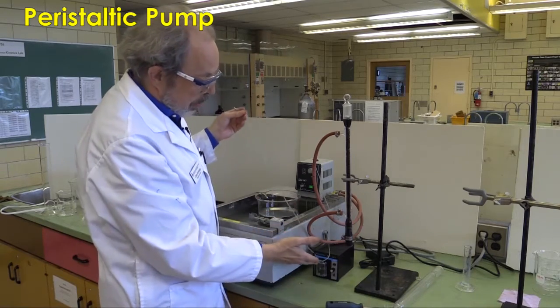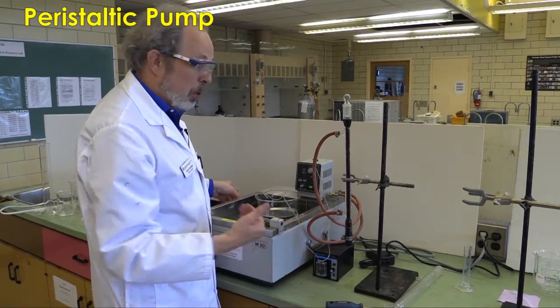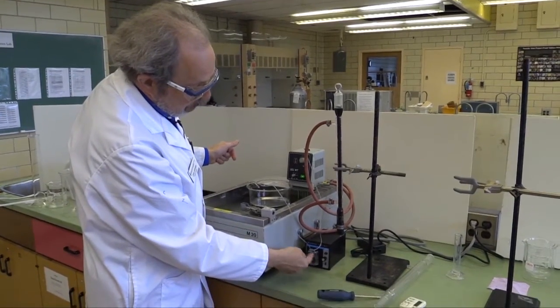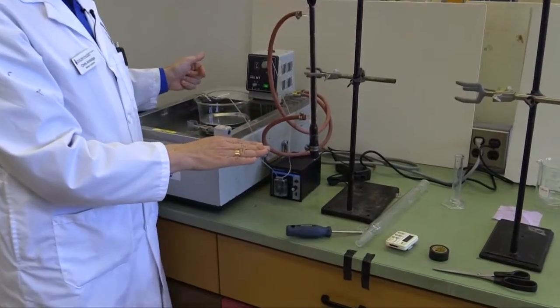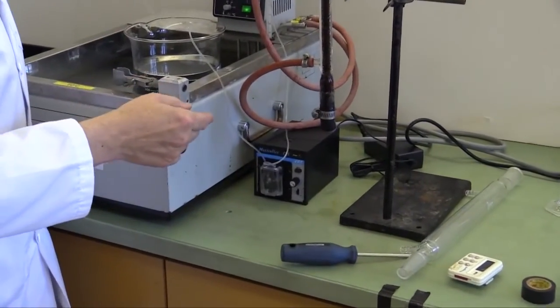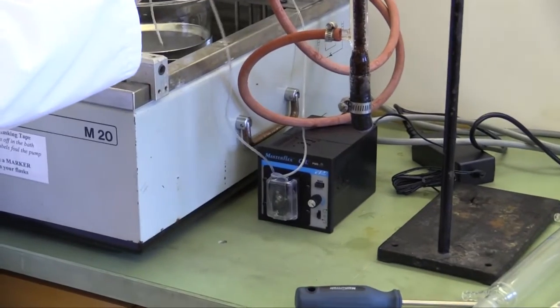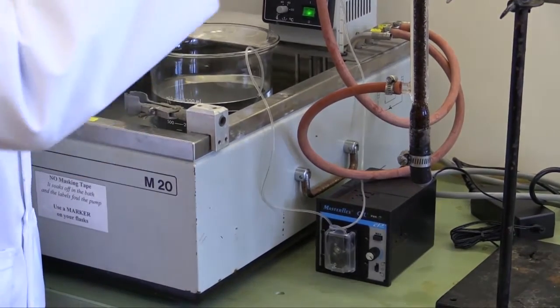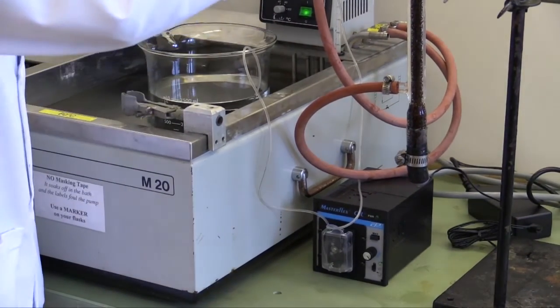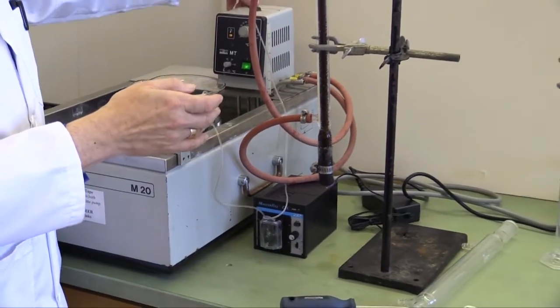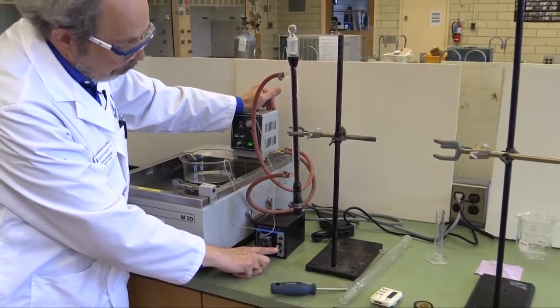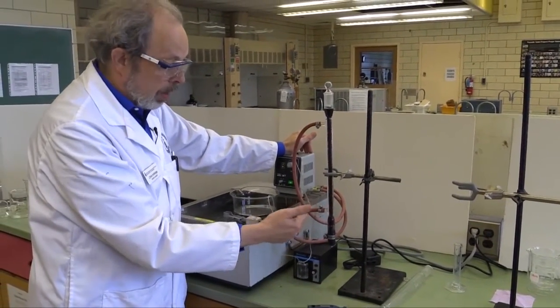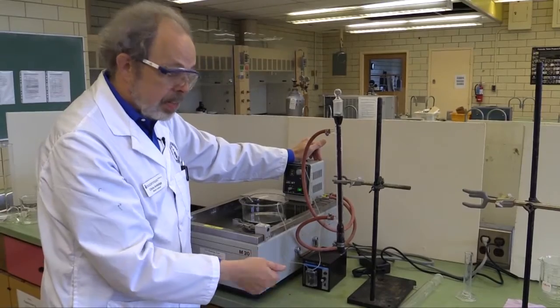This is a peristaltic pump, meaning it works the same way that your guts do, actually. And it's a tube with a roller that pushes the liquid through. There are two ends of the tube, of course, and the free one goes actually into the reaction mixture, like that. And the other one goes to the top, and this is going to go into the top of the reactor.